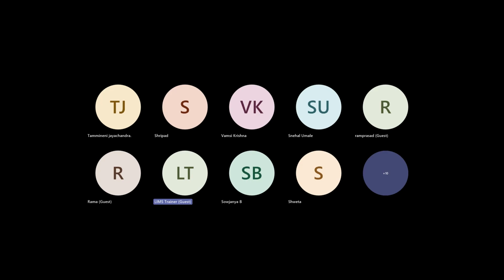Crystal Report is itself one separate topic, so that is not covered. Crystal Report is reporting in LabWare LIMS. If you go into the Crystal Report manual, it's a 2,500 page thing. Crystal Report is not a part of LabWare LIMS. You create reports using Crystal Report in LabWare LIMS. Crystal Report is created by SAP. So there is software, SAP Crystal Reports, where you go and create the report.